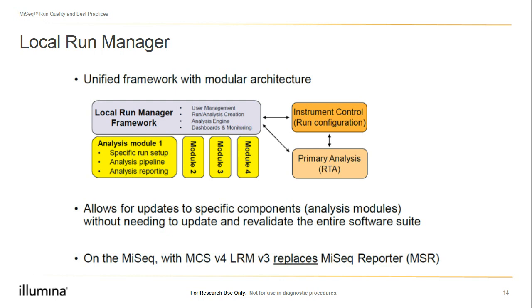This is great if you want to, say, take a set of data and run it in one module, but then you would like to investigate a different question or a different application with that same data, and you can actually just requeue it through Local Run Manager using that different module here.